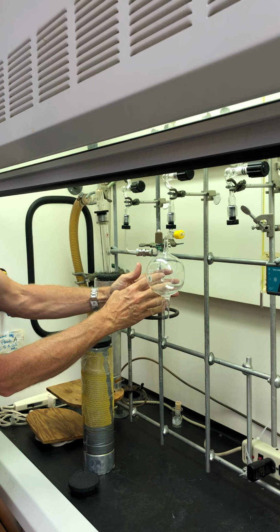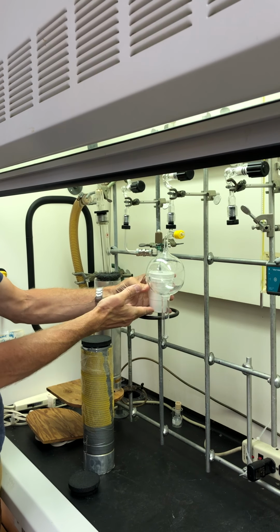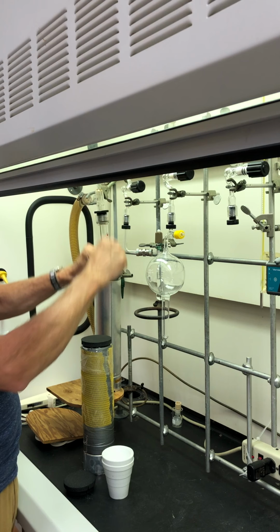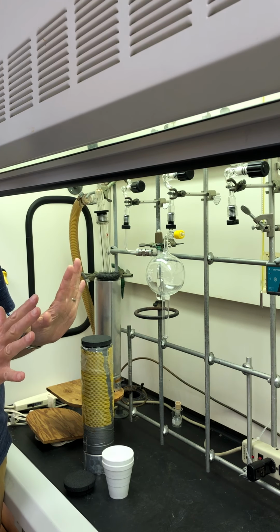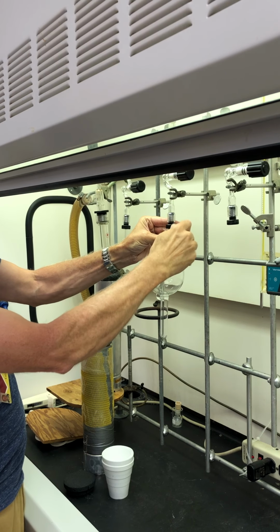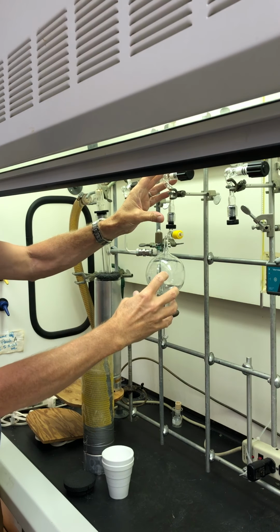So we'll freeze it with a little insulated container. Pour some liquid nitrogen in there, freeze it. When we pump on it, we'll remove all the air, and then we seal it back up and let it become liquid again. So that's the purification process. Once we pump all the air out of this bulb, and we seal up this valve to the gas bulb, and this valve B, once those are closed, you can remove this.